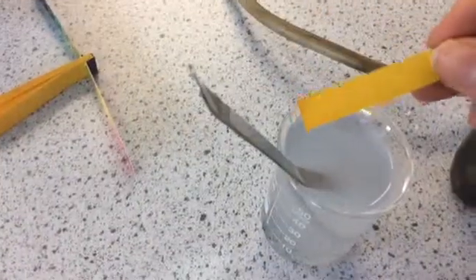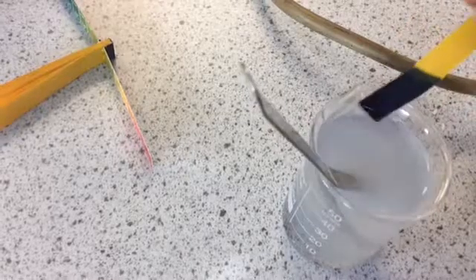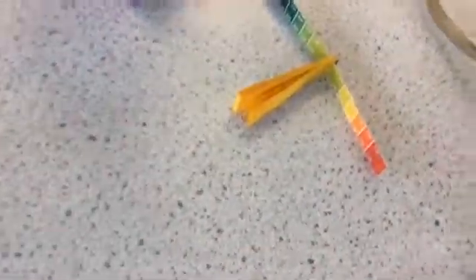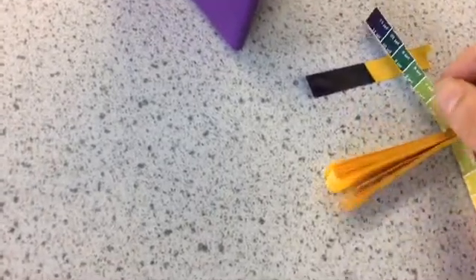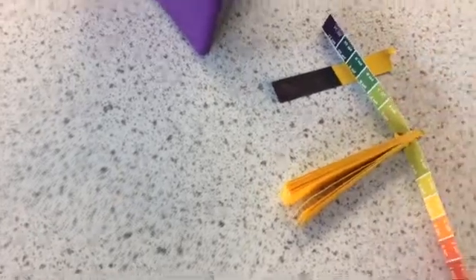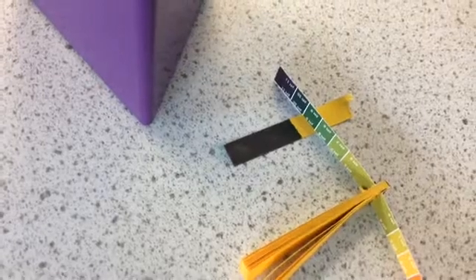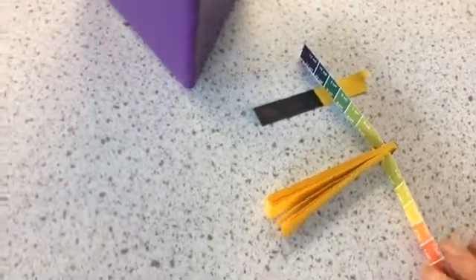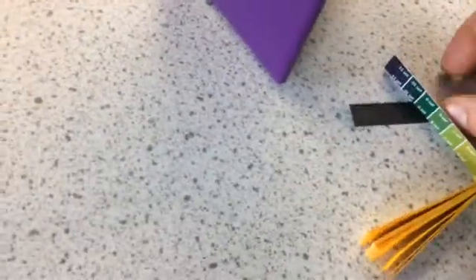So we are going to try putting our universal indicator paper in. Perfect. And you can see it's gone blue. And if we match it up here, it's a bit difficult to see the color on the iPad, but actually it's more of a really dark green, so pH 9, possibly 10, rather than this blue, which is the strongest.